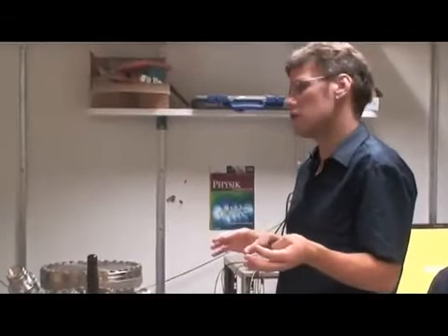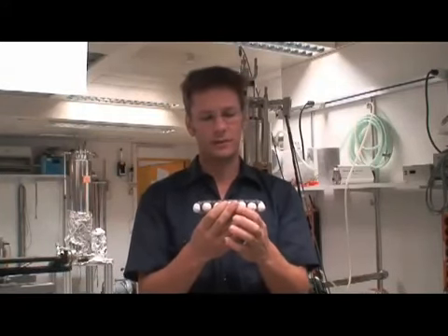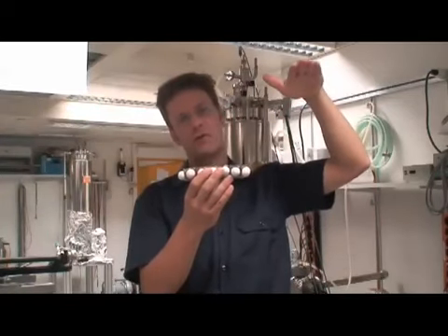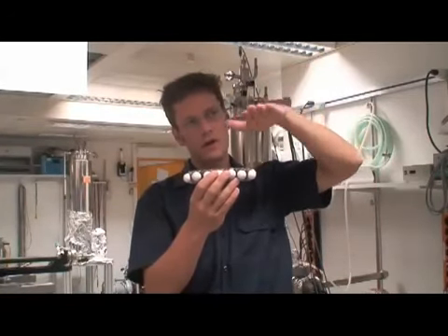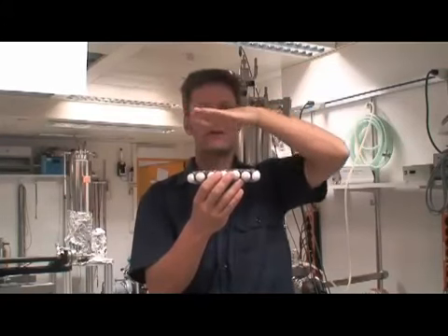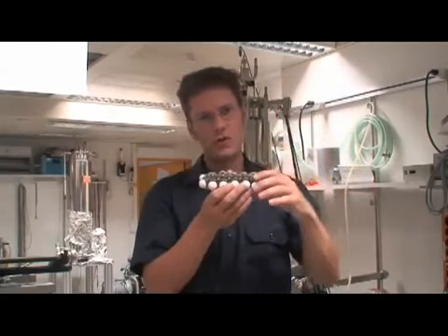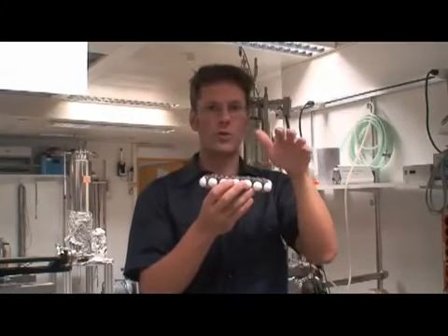IBM scientist Leo Gross explains, "So the calculations helped us to understand what is the origin of the contrast that we observe in the experiment. And I'll try to explain this in brief. First, we image the molecule far away. Then we see attraction by van der Waals forces. And this attractive part has no atomic corrugation. So the whole molecule is just imaged as one blob.